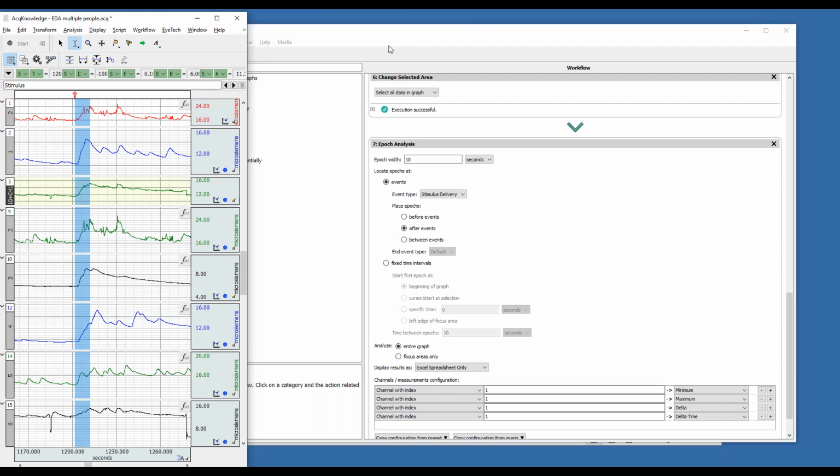The workflow really aids in your ability to automate these. Hopefully that gives you some ideas of A, how to use it, B, ways in which you can employ it to save time. So Brenda, I'm going to hand back over to you. Maybe we've got some questions that I can help answer.